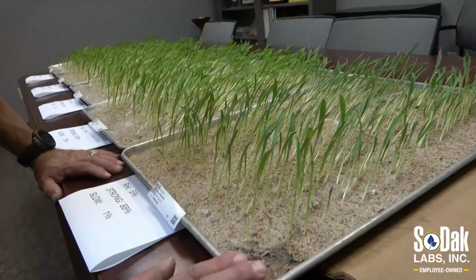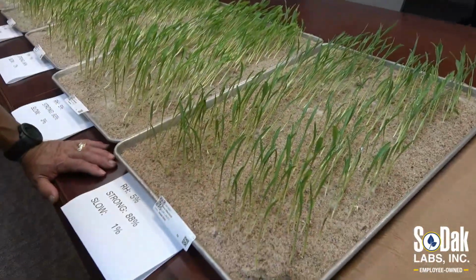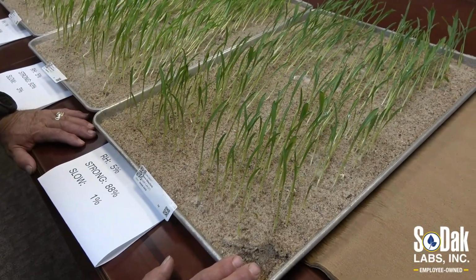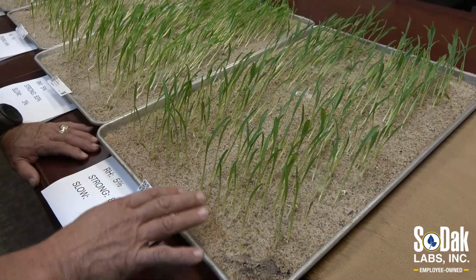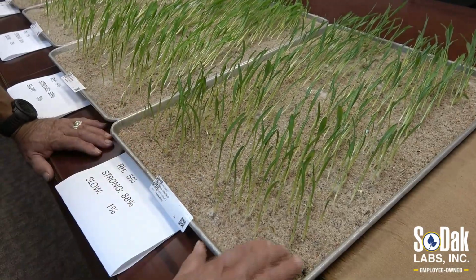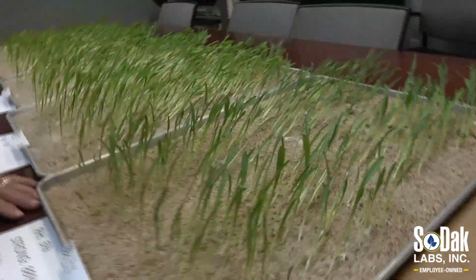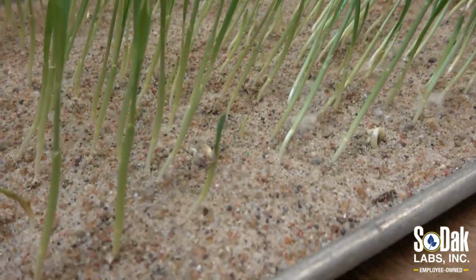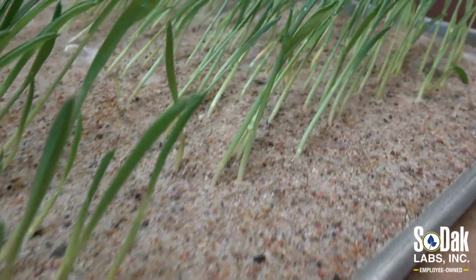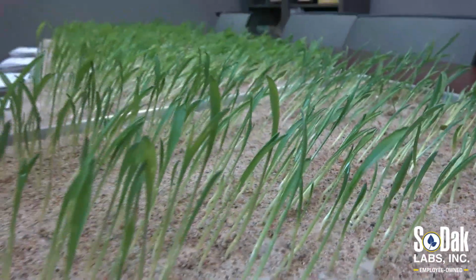The seeds are planted, and we're mostly looking at SH2 sweet corn here today, and then it's covered with sand, and this is a river washed mason sand. So a little bit of variability in particle sizes, but in general pretty uniform medium. We like sand because it does a couple things. It allows uniform water uptake, which helps us see difference in seedling vigor.